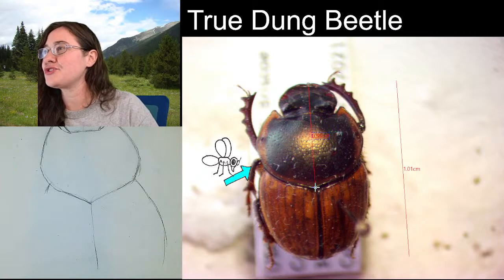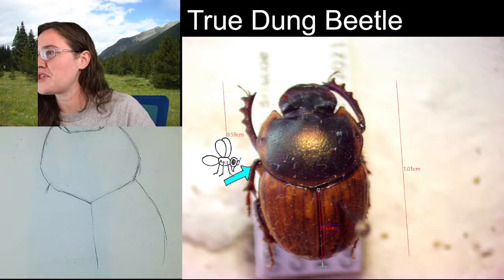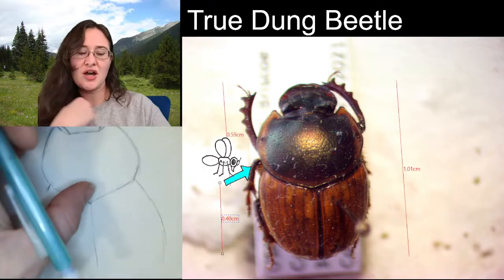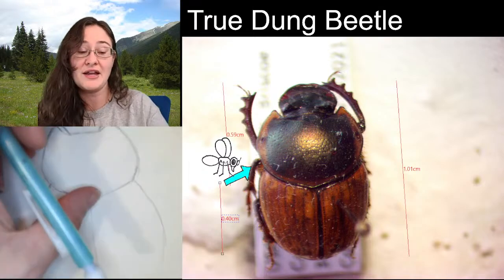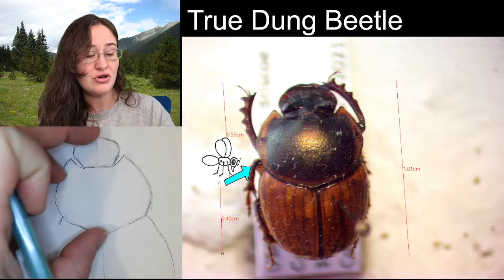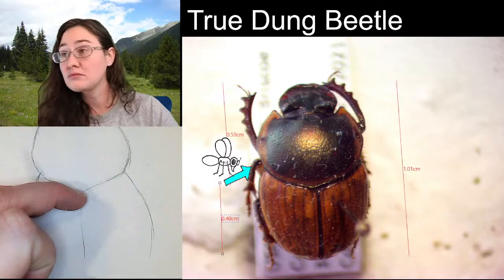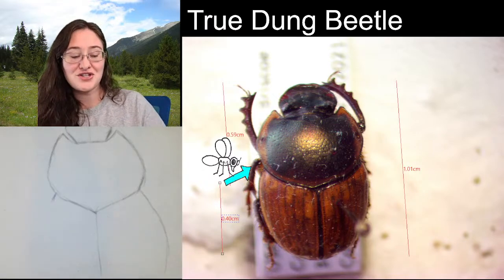From the head to the end of the pronotum, it is 0.59 centimeters. But then from the end of the pronotum to the end of the elytra, it is 0.4 centimeters. So your elytra are going to be just a little bit shorter than the combined length of the head and the pronotum. You can do that with a ruler, or you can do that with your hands. And I said just a little bit under. And you got a little short little elytra here.